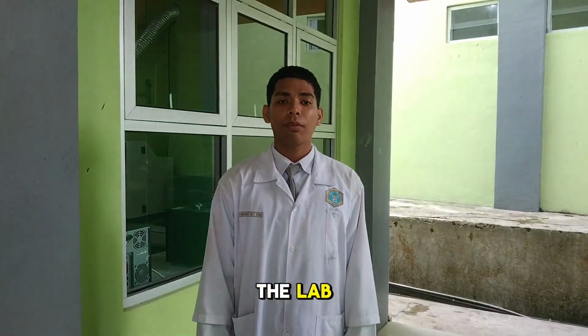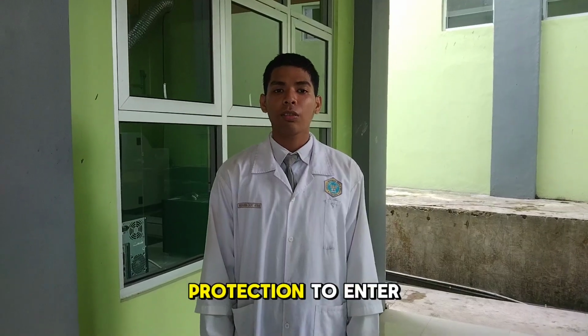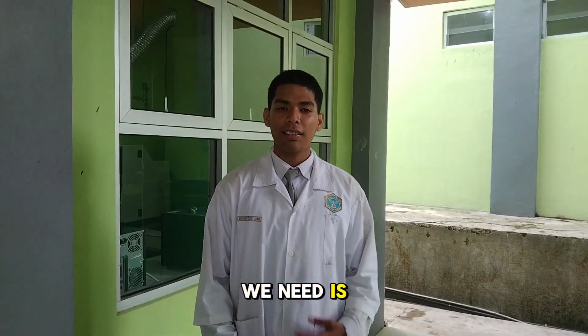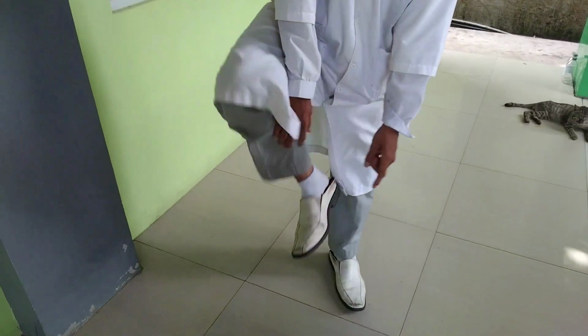Before we enter the lab, we must wear protection. The protection we need is a lab coat and lab shoes, and that's all.